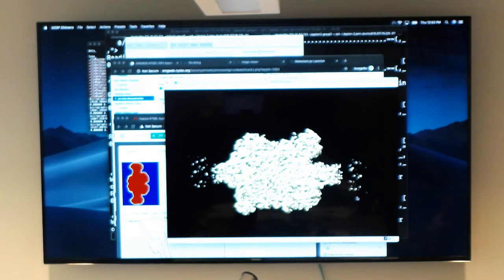So again, this is the danger of using resolution as your only criterion, because you don't have a defined state. In structural biology, especially if you're doing averaging, you need defined states. We don't handle continuous conformational change at all well, because that would equate to an infinite number of states, and if you're doing single particle, you need an infinite amount of data.